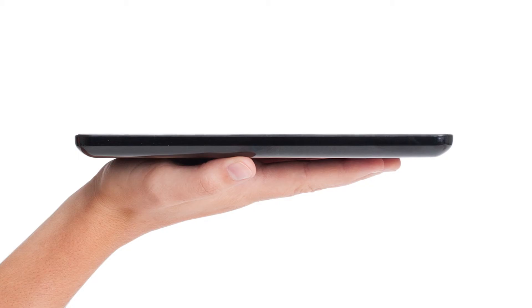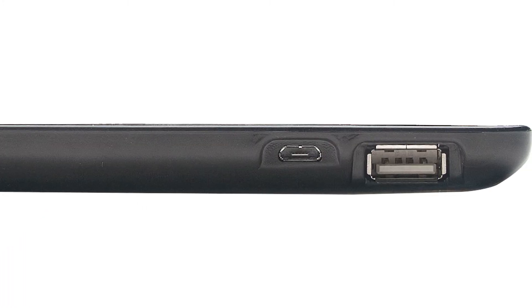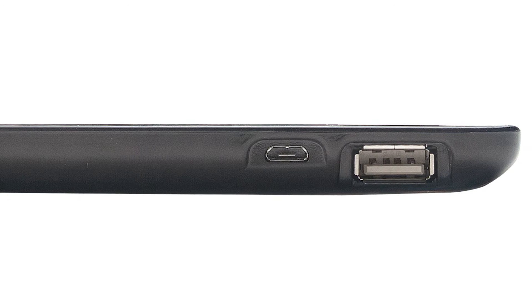Edge is incredibly thin and weighs less than 10 ounces. It has an 8-hour battery life and dual USB inputs — one standard USB for data export with a flash drive, and a second micro-USB port to connect to a computer for file export and for charging your Edge.